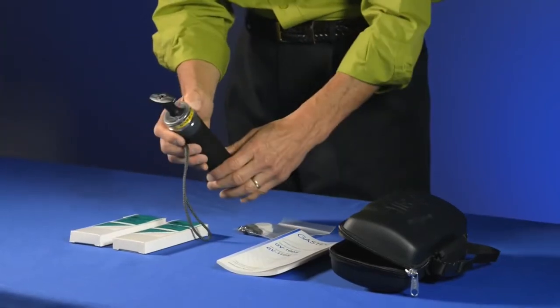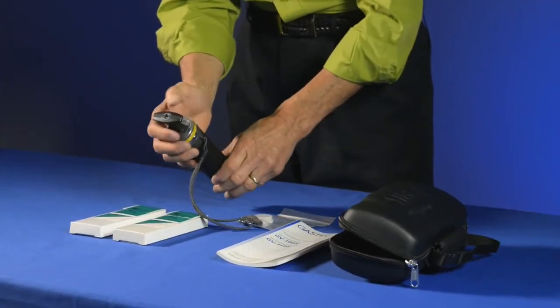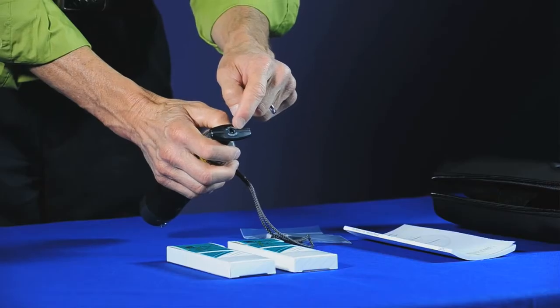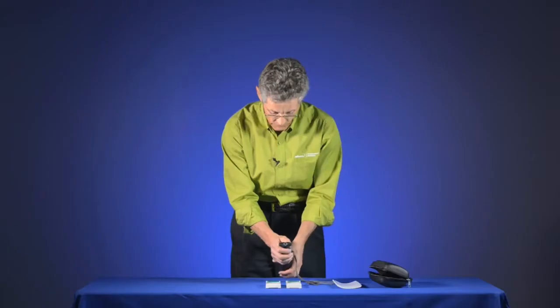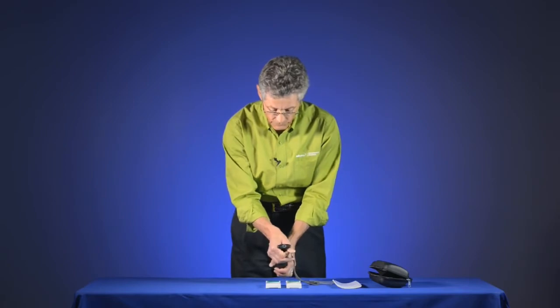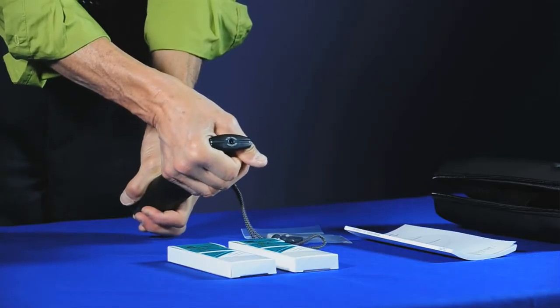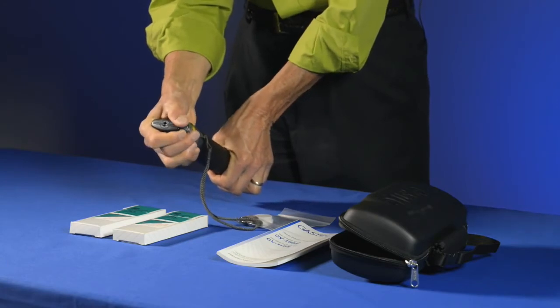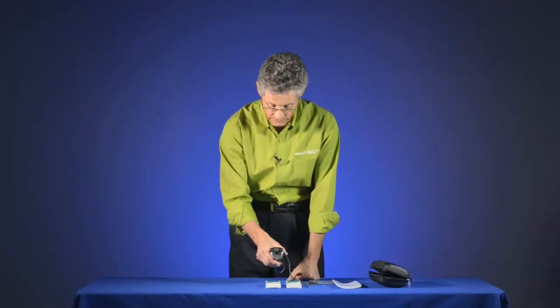The other feature on the GAS-TEC pump is a flow finish indicator. At the end of the handle you'll see a bright white dot. When I put a tube in and draw a sample, that white dot disappears. Once the sample is completed, the white dot reappears and the pump is ready to go.